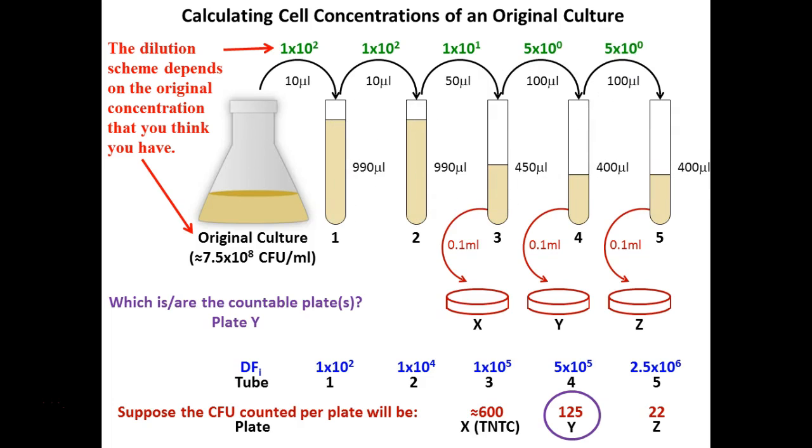And I want to go to microliters. What you have there on your sheet is in microliters, which is equivalent to the milliliters seen here. So even if you were to calculate it either way, you would get the same dilution scheme. That's the point that I wanted to make.